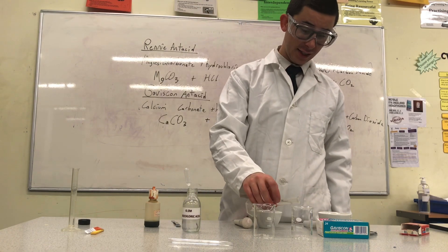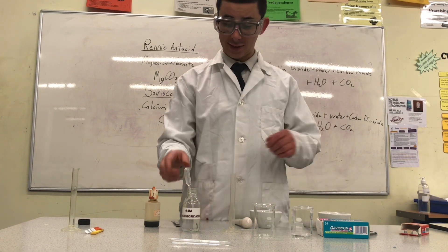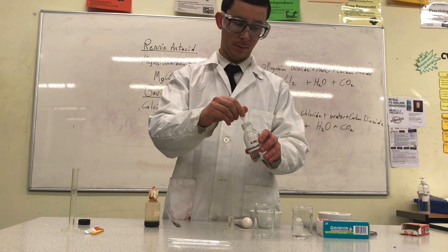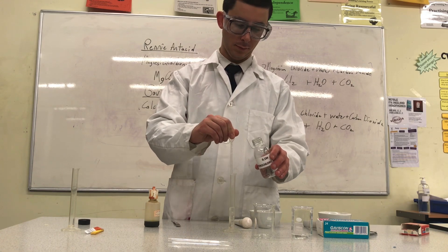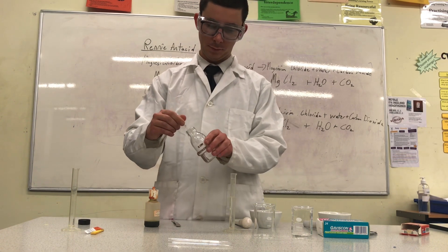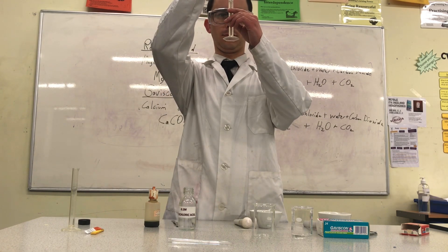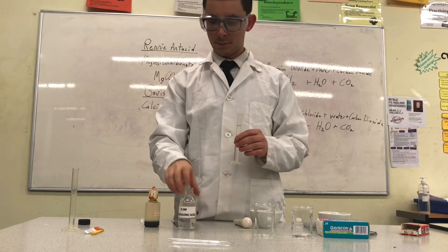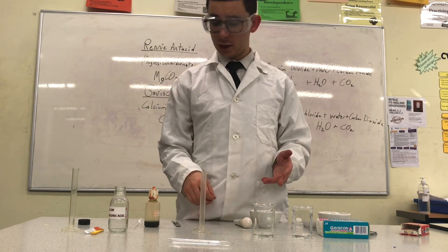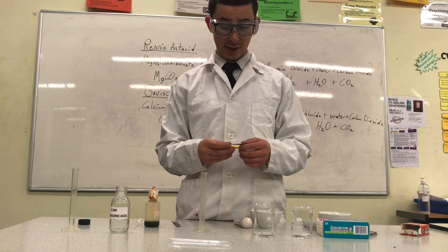Now I'm going to pour 10 milliliters into my first beaker, and I'm also going to pour 10 milliliters of acid into my other beaker. This is very similar to the acid that is in your stomach.